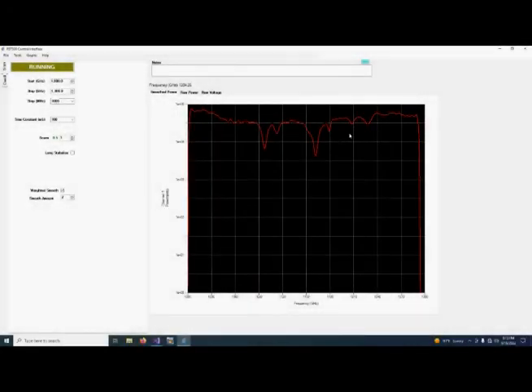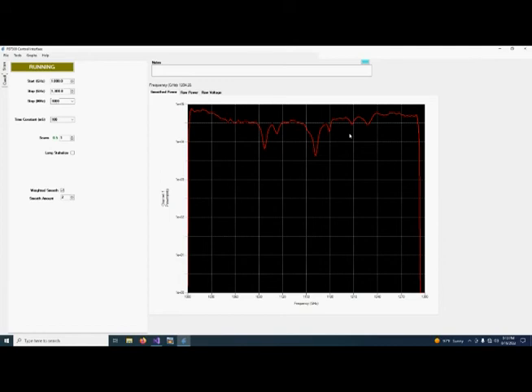So now that we have the system more in balance than it was previously, we're actually getting a cleaner signal on the summation. Because the fringe pattern spacing is less than one gigahertz, which is our step size.